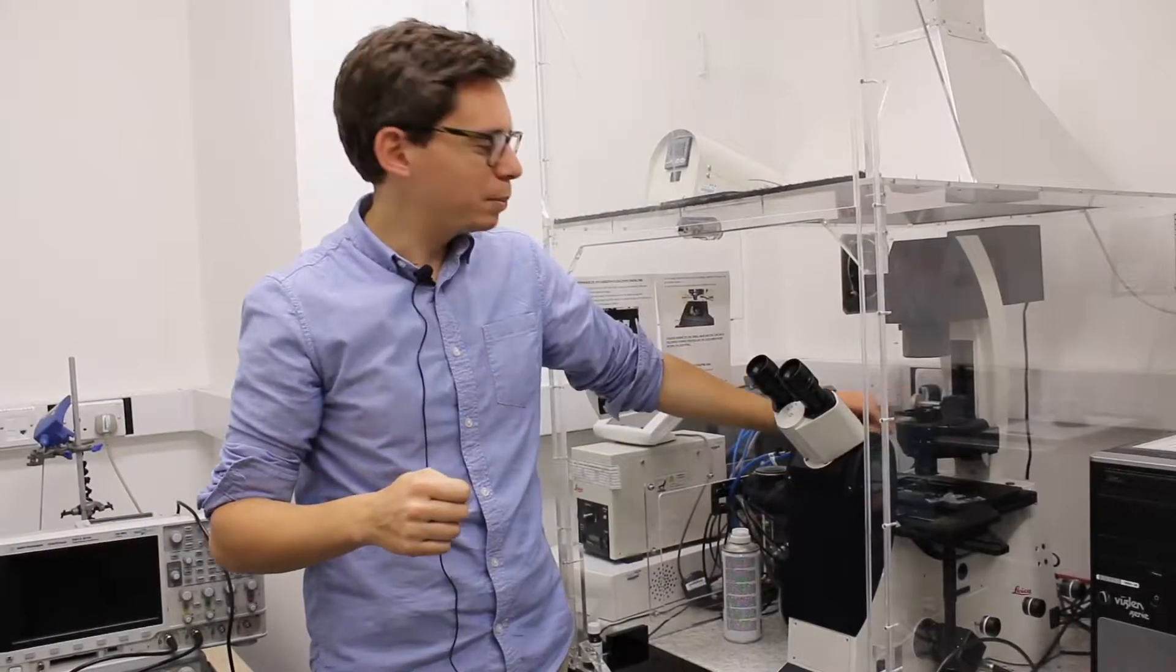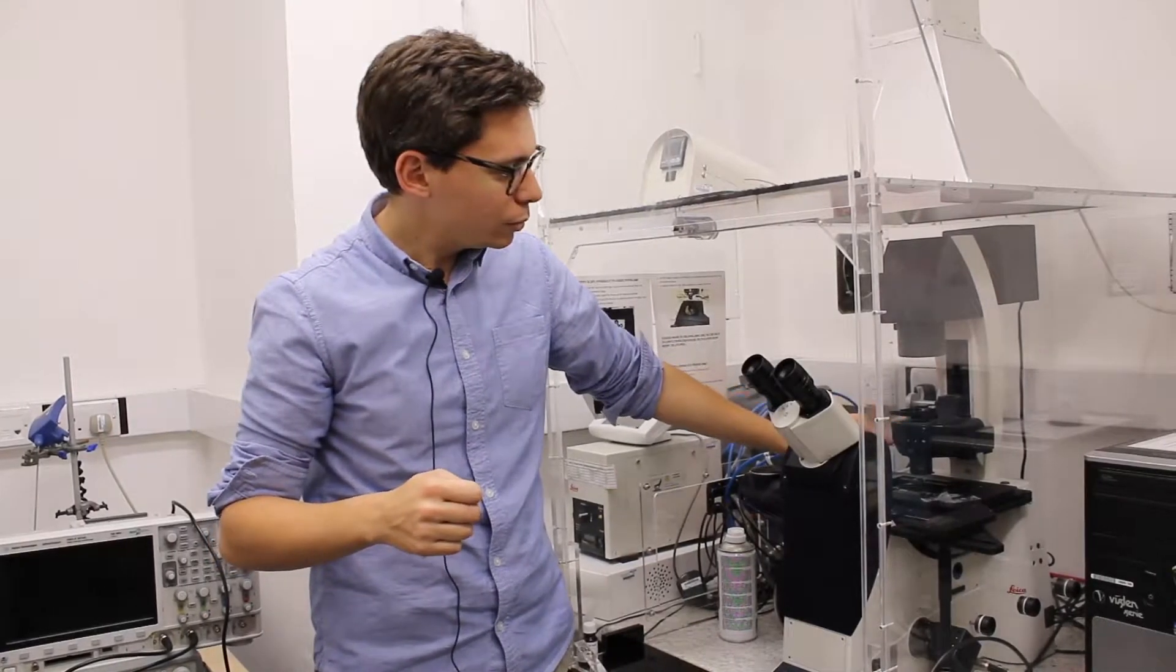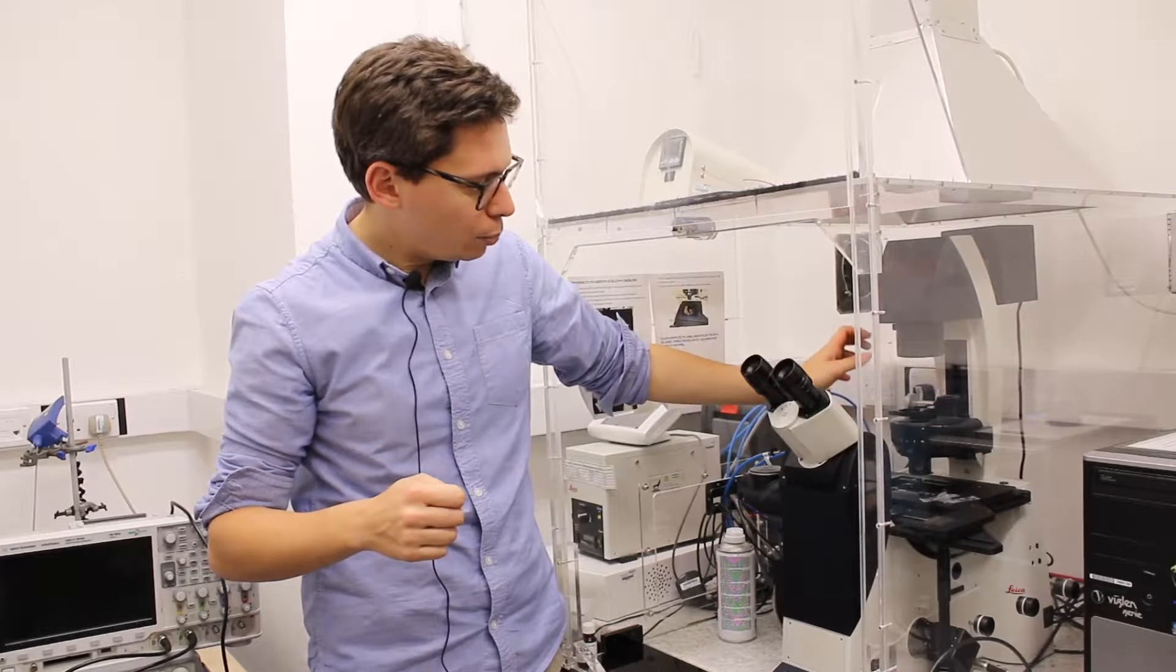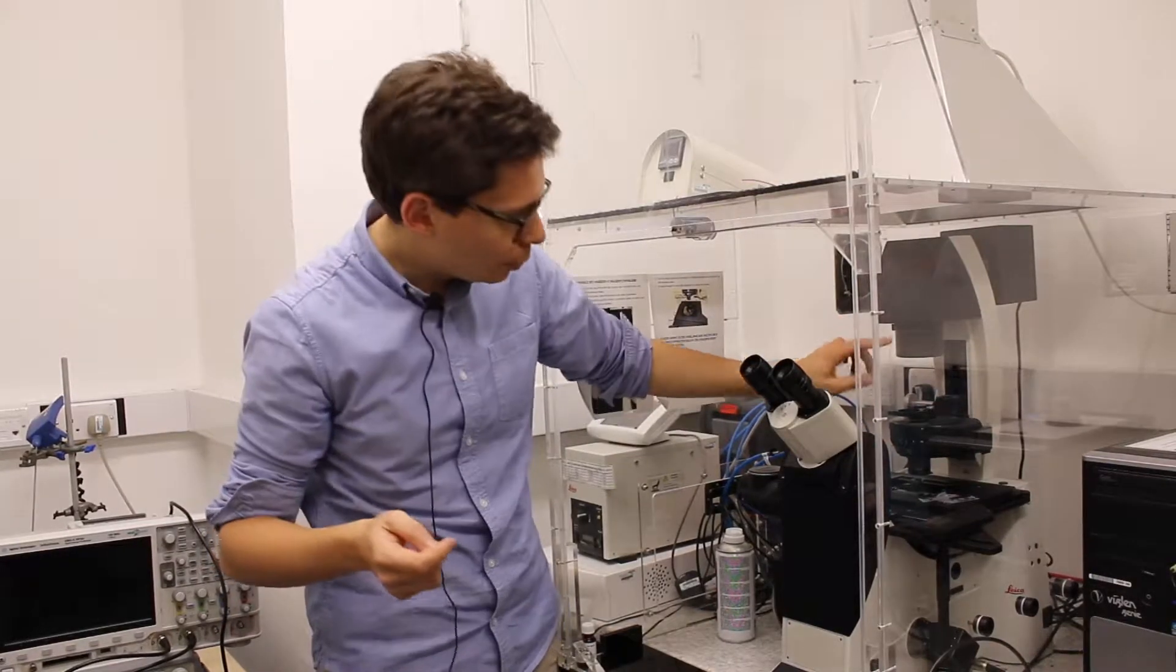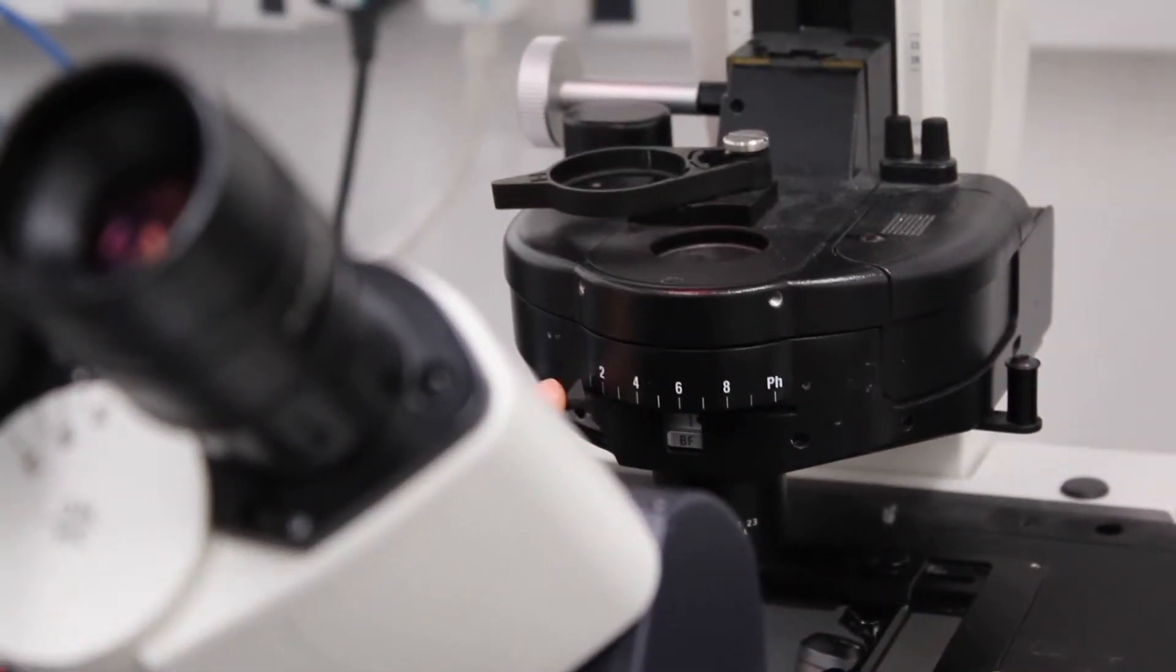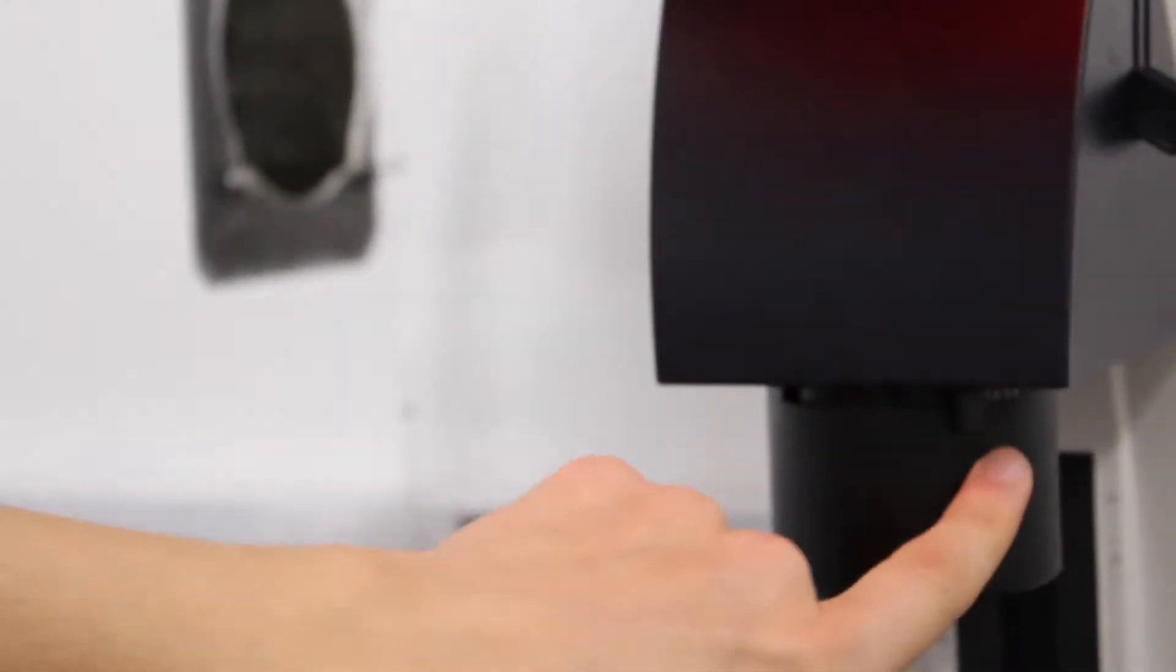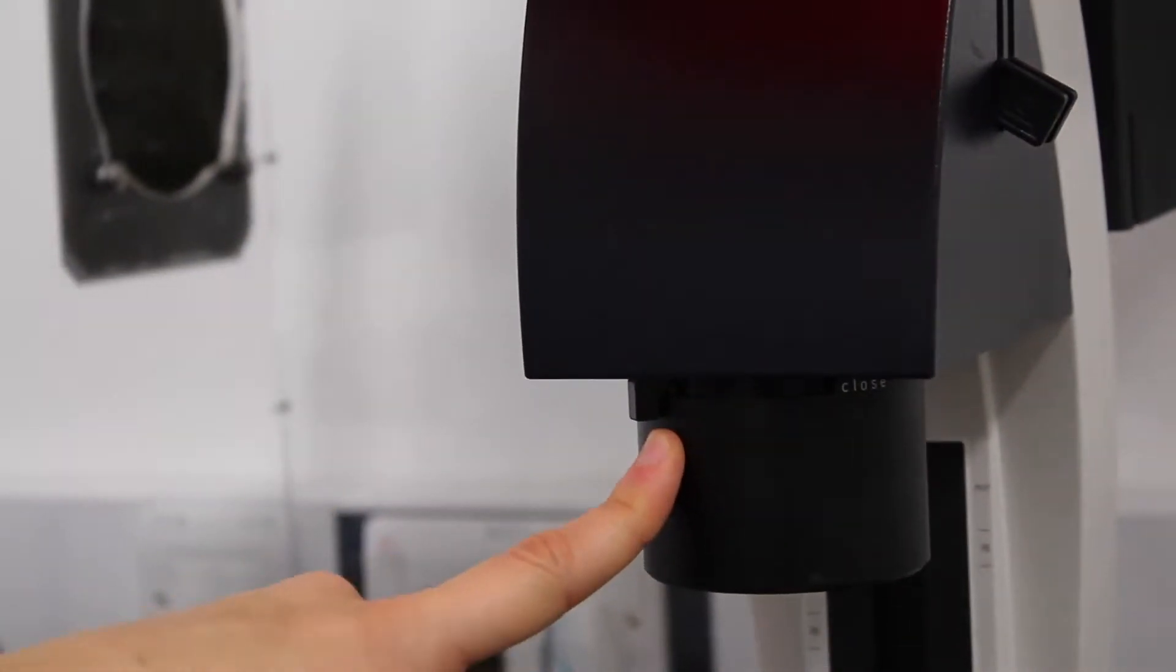There are two sets of diaphragm that control how much light goes through the sample. At the beginning you may want to open them completely if you don't know what your sample is. So there is one here that you can close or open, and there is one here that you can close. It's written close or open. That's a diaphragm, so they will control the amount of light going to the sample.